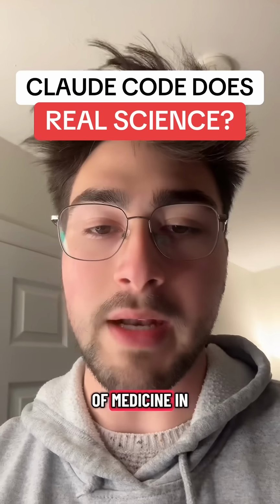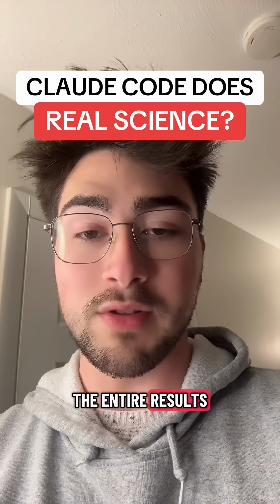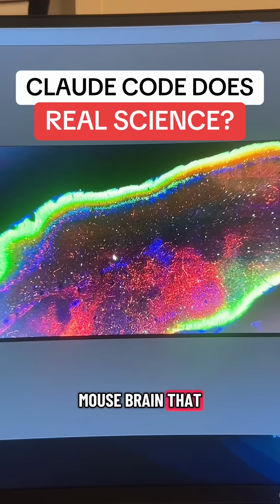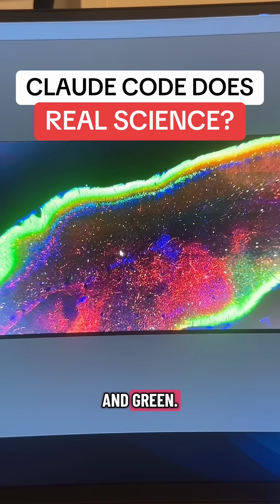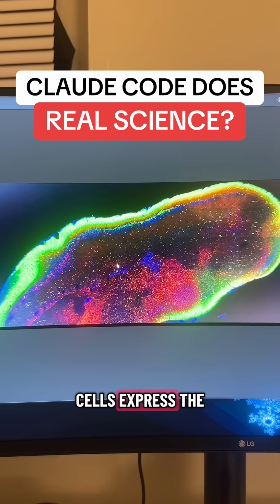So I work at Yale School of Medicine in a neurobio research lab, and here's how Claude Code helped me draft the entire results section for one of my experiments in under an hour. This is a section of a mouse brain that has two different proteins stained in red and green, and I needed to count how many cells express the red protein and how many cells express the green protein.